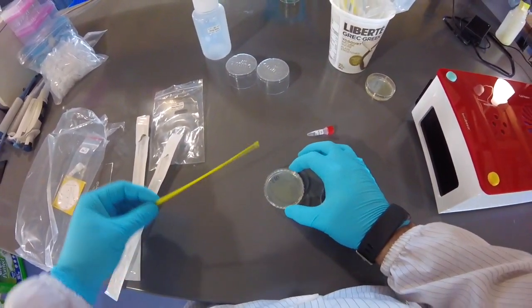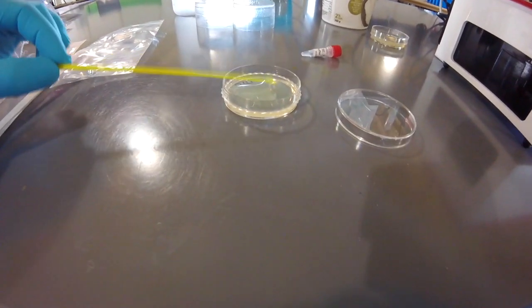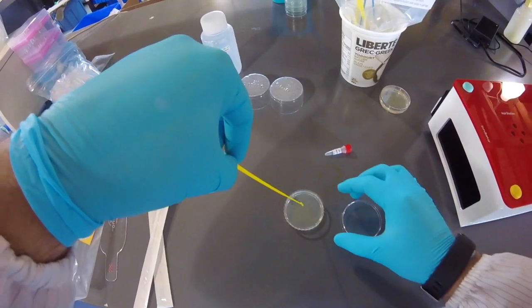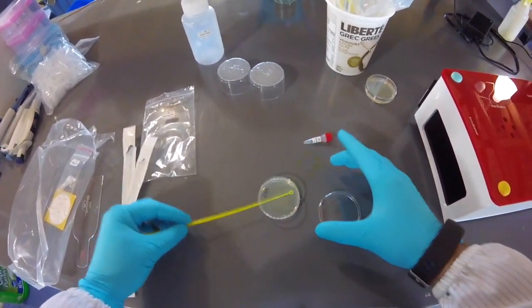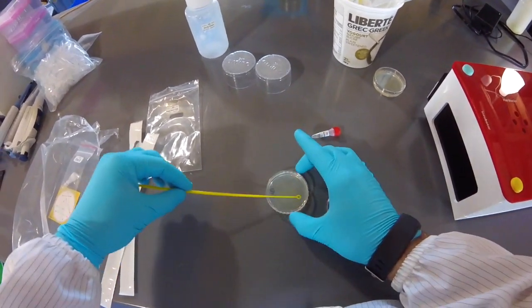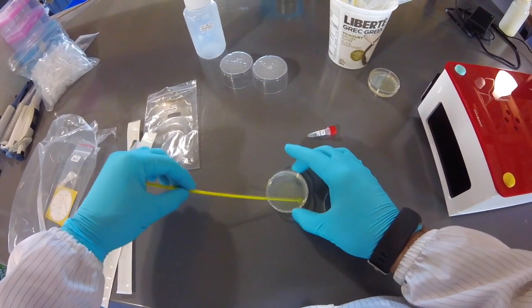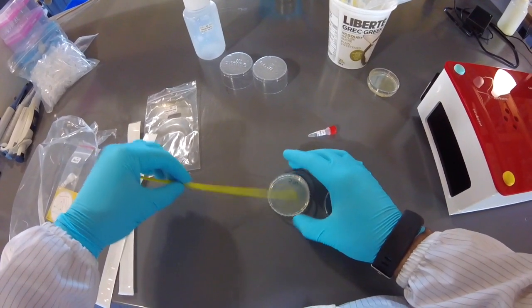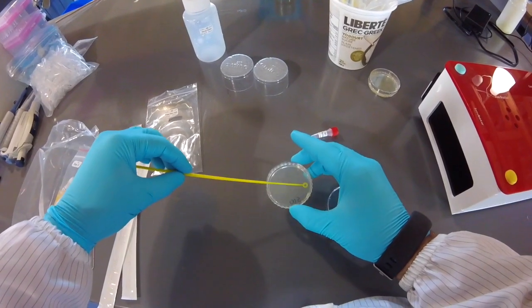Okay, now I'm going to take my loop, and you always want to be using inoculation loops at a kind of sharp angle, right? So you kind of want to be working down at this angle. If you work pointed downwards, or if you try and spread like this, you're going to poke into the agar really easily. So I even touch the edge of the Petri dish and rub around, and you can spin the plate with the other hand. And eventually it should cover everything nicely. There we go. The plate is covered.